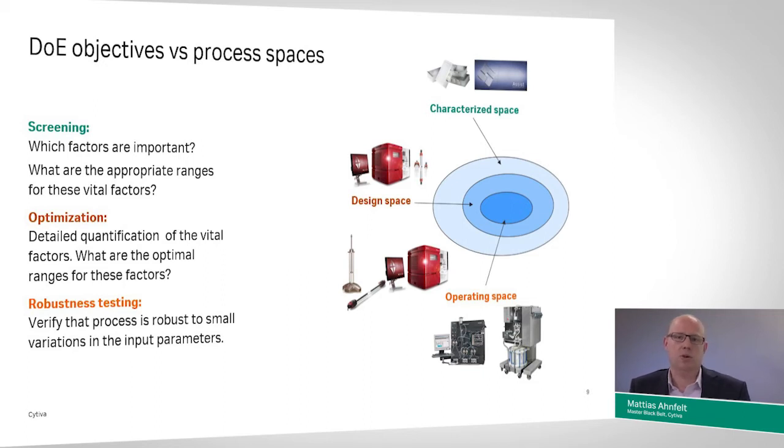So do we get approved purities and impurity profiles and acceptable yields for our process around the sweet spot from the optimization DoE? So we're not trying to build a new predictive model or develop a complex transfer function when we do robustness testing. We run a few experiments in a structured way to make sure that the conclusions and indications we saw in optimization are indeed correct, and also that we have a scalable, nice, transferable process over to manufacturing.